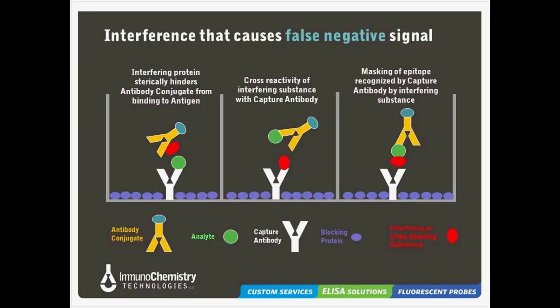So just letting you know, this isn't the end of the world, but you can put stuff in there that, because the soluble receptor has a lower binding affinity to your target analyte, if you disrupt that, you'll still have enough antibody capture activity to still grab the thing. So again, that's where ELISAs become projects.